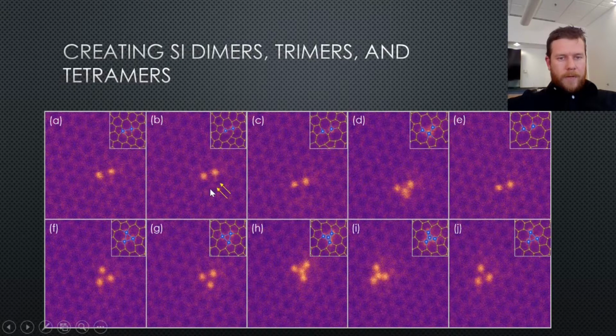And here we're observing a bond rotation. So below these 2 silicon atoms, and maybe it's more clear here, we have 2 carbon atoms sitting next to each other. They begin to rotate here, and actually what you're seeing is the juxtaposition of the before the rotation and after the rotation, because this rotation occurs on the order of 100 femtoseconds or so, but our beam is not fast enough to capture that. So anyway, the bond rotates. We have this new configuration. Momentarily, a silicon atom comes and sits here long enough for me to get one image of it, and then it was knocked away back to this configuration, same as C.